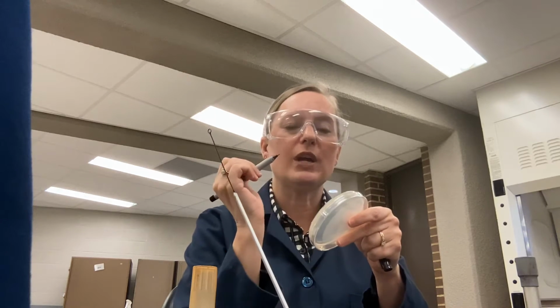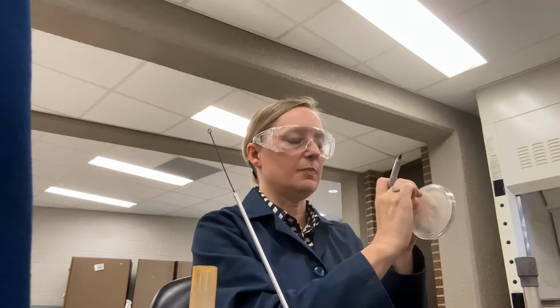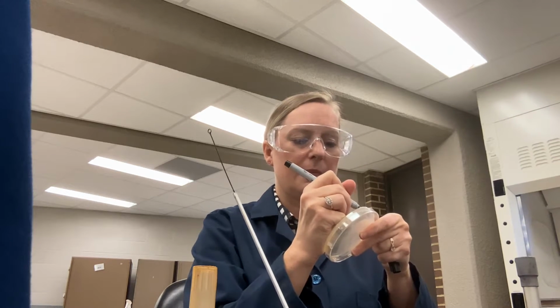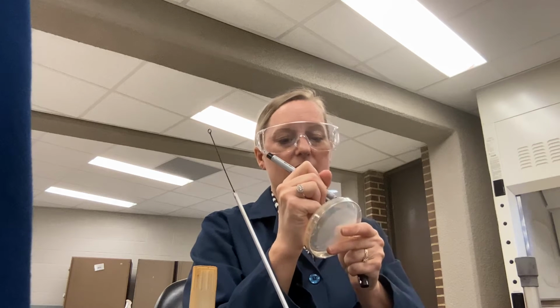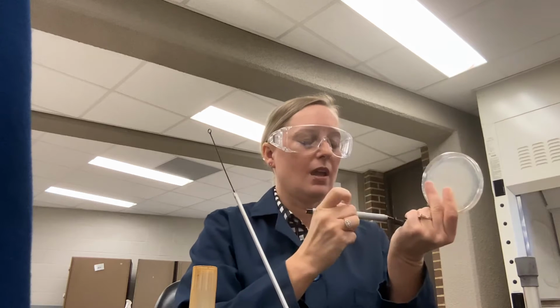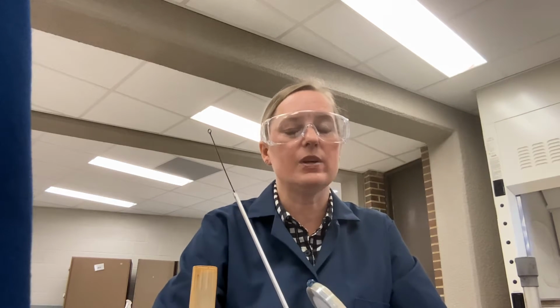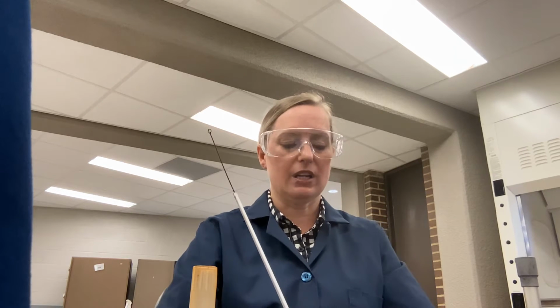You're going to want to write small and kind of on the edge, not on this edge, but kind of around the circle. So I'm going to put my name and what is in it, which is, in this case, E. coli. It's important to label before we begin so that we know exactly what is in our plate, because sometimes you'll be using multiple plates and we don't want to get confused.